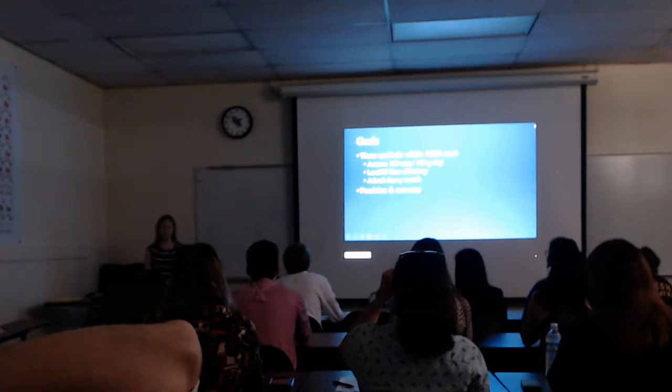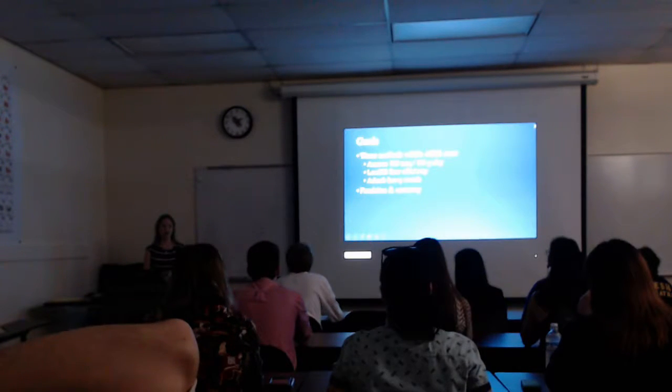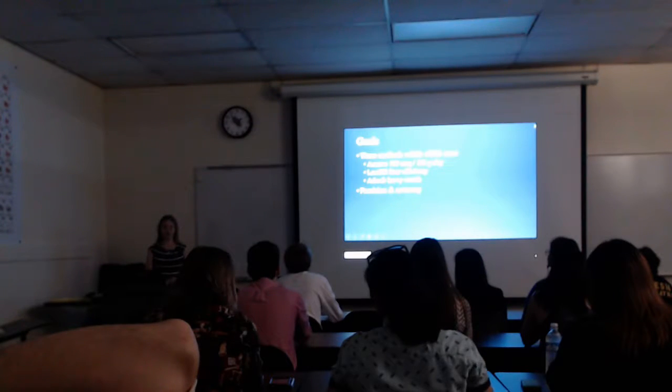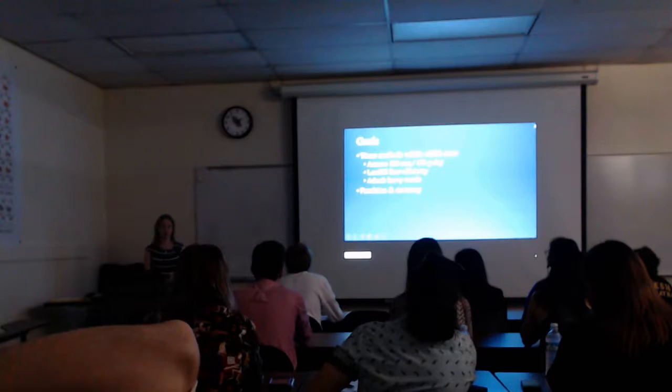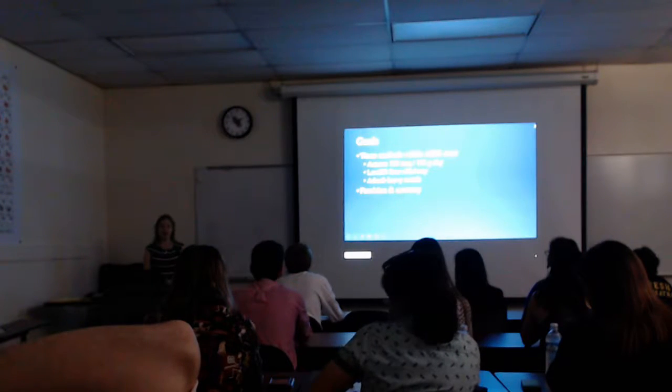and you test it with one of our 3 methods, the ammonia gas selective electrode method, the ultraviolet visible light method, or the atomic absorption method, and you get a CEC of 80 to 120, it could all still be the same clay.